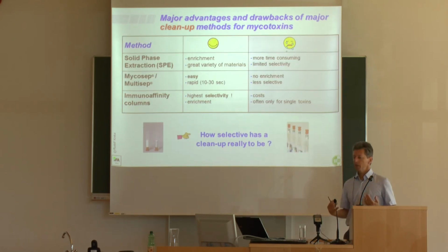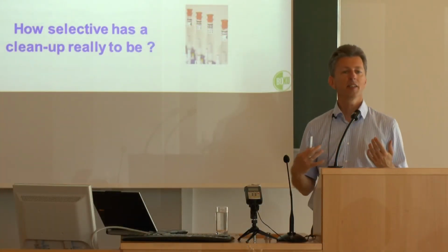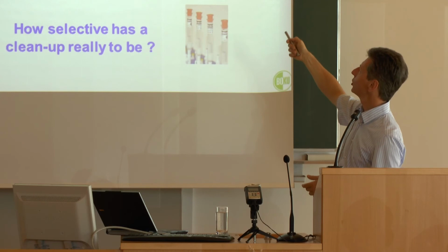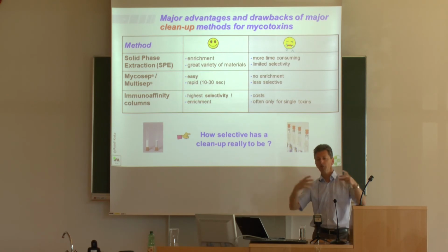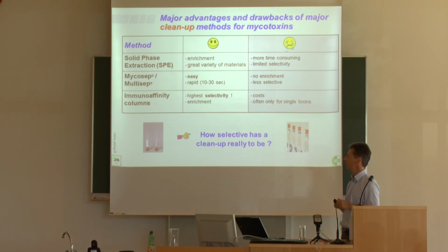Once you have forgotten about all the things you learned at the Mycotoxin Summer Academy, you can always go back to your script and find a summary of the major advantages and drawbacks of major cleanup methods for mycotoxins. Solid phase extraction has the advantage of enriching the analyte of interest, and there is a great variety of materials on the market where you can play around with chemical properties. On the other hand, it's more time consuming than other methods, and it has limited selectivity compared, for instance, to immunoaffinity columns.